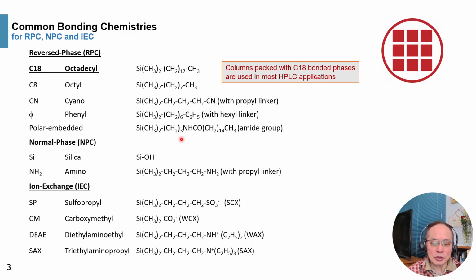This particular one uses an embedded amide group in the hydrophobic chain. So in the middle of the chain, there's an embedded amide group.